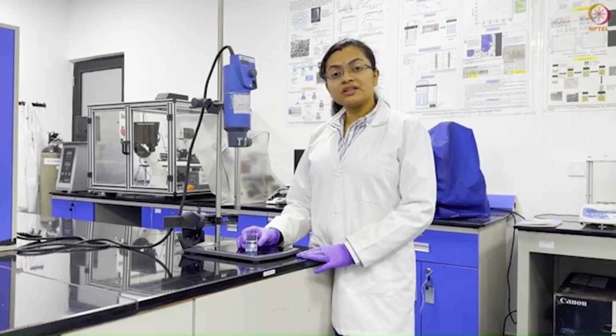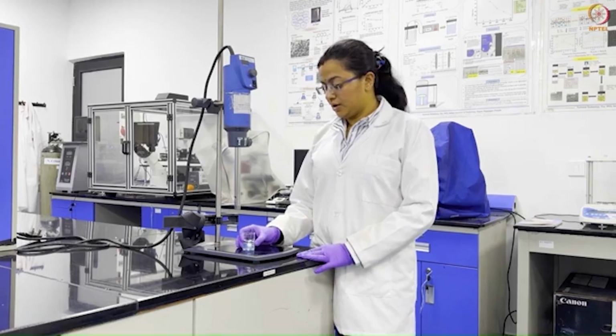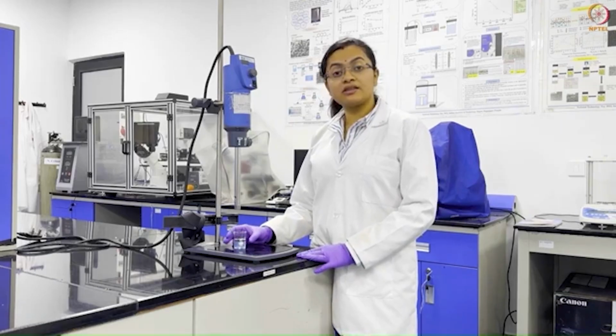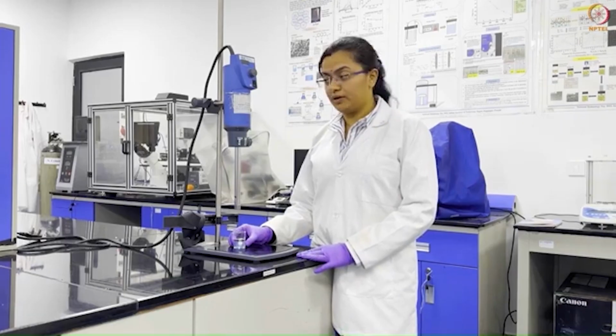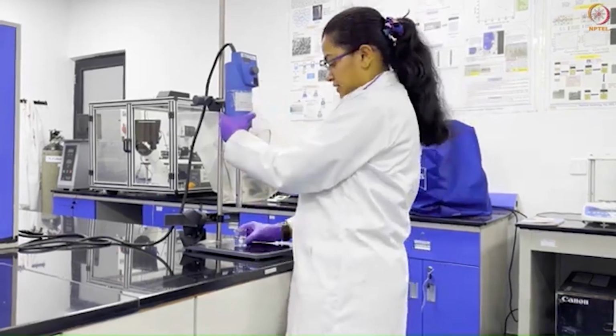We have prepared the sample. We will run it at 10,000 RPM for 2 minutes, and we will then analyze the result under the microscope and compare it with the probe sonicator to see what the difference between the results is. Now here I'm placing the sample in the sample holder. Now we just put this in the sample.